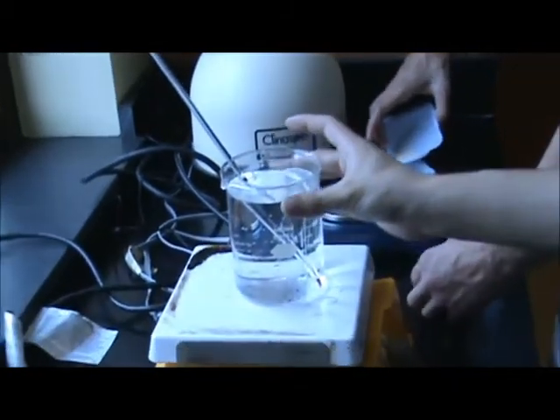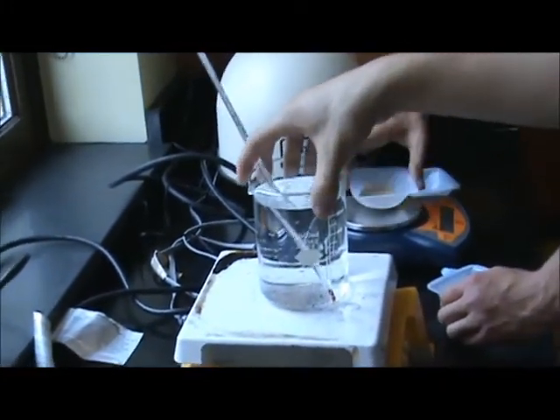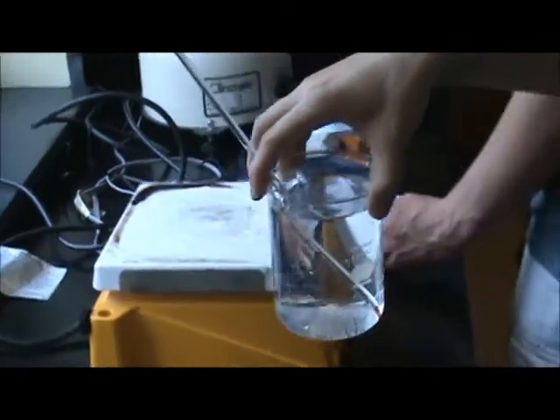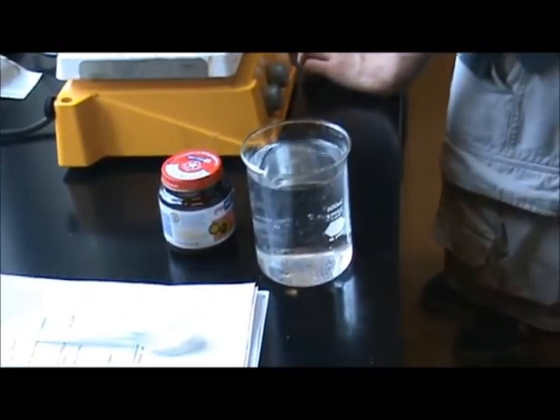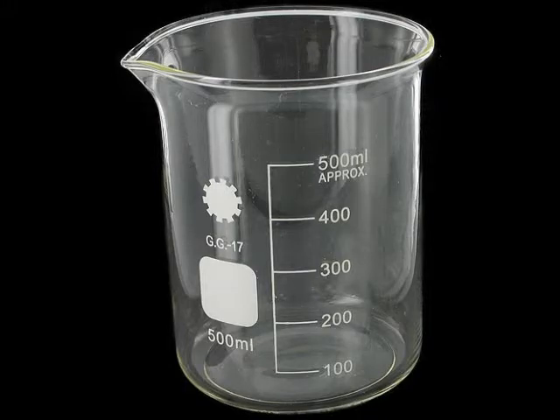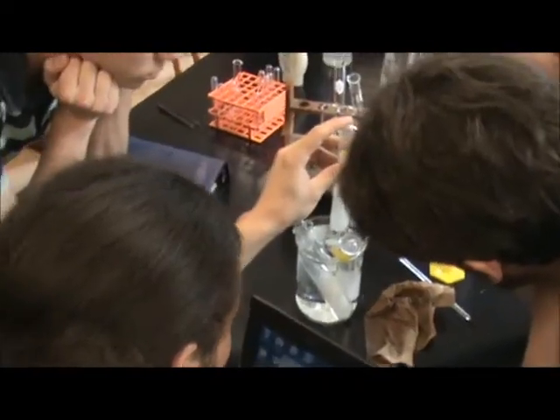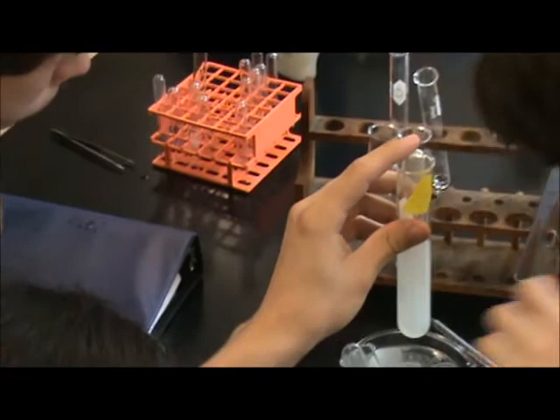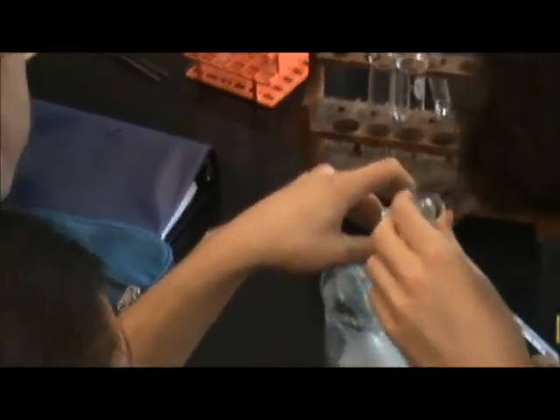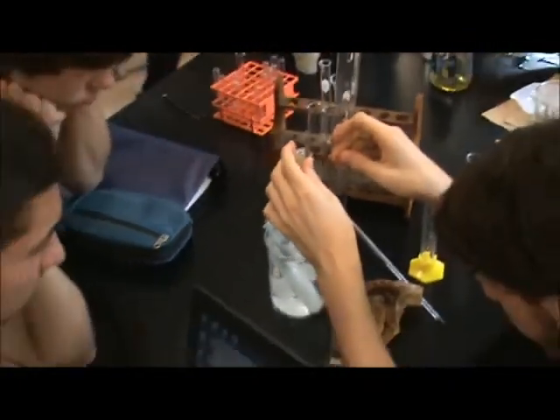The smaller test tubes were then inverted and placed into the larger test tubes, already containing the yeast solution. Each sealed environment was placed into a large 500 milliliter beaker of water, kept at 30 degrees Celsius, the appropriate temperature for yeast to undergo respiration at a delayed and observable rate. The second larger beaker was merely used to hold the yeast solution. The test tubes were left at this warmer climate for 5-minute intervals, for a total of 45 minutes. At every 5-minute interval, the test tubes were removed and the bubble production was observed and recorded in our data table via ruler measurements in centimeters.